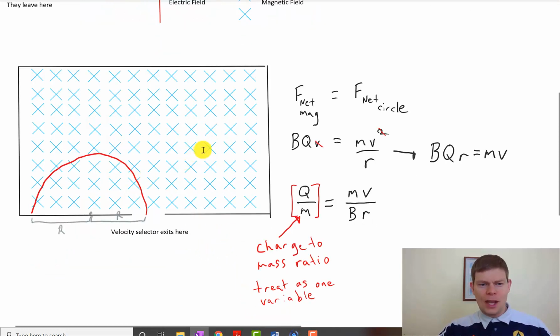And you just have a uniform magnetic field in an area, and detectors along the sides. So your detectors are along the sides here. And what does a charged particle do if it's moving perpendicular to a magnetic field? It moves in a circular shape. So it'll immediately arc and smash into the wall. And we will know what distance, what the radius of the circle it had to smash into the wall there, if we detect it right here.